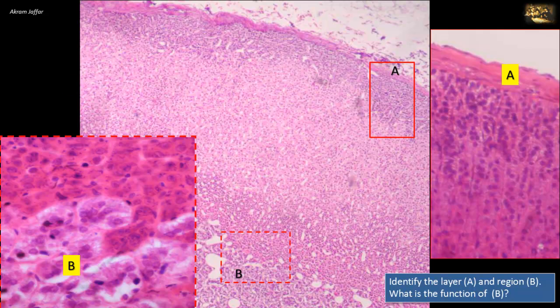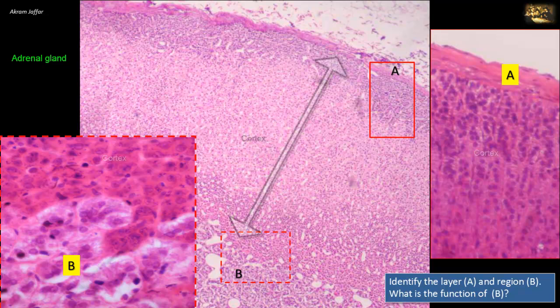Identify the layer A and the region B. What is the function of B? This is a section of the adrenal gland showing an outer cortex and a central medulla. The layer marked A is not a glandular tissue, but is formed of connective tissue representing the fibrous capsule of the gland.